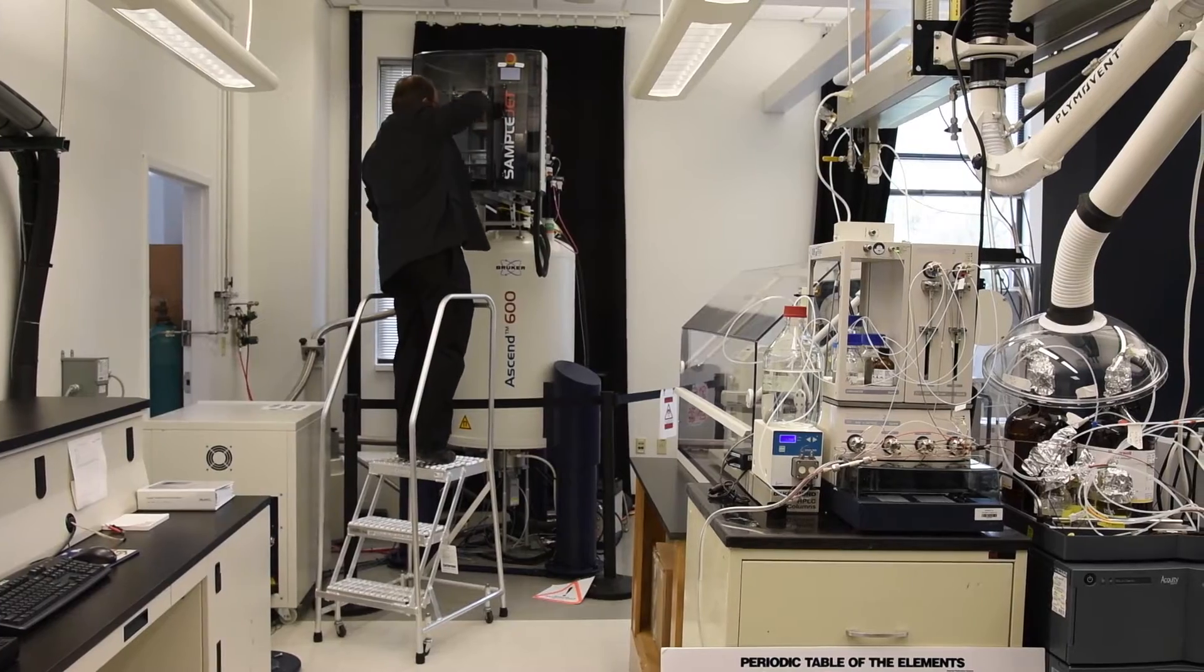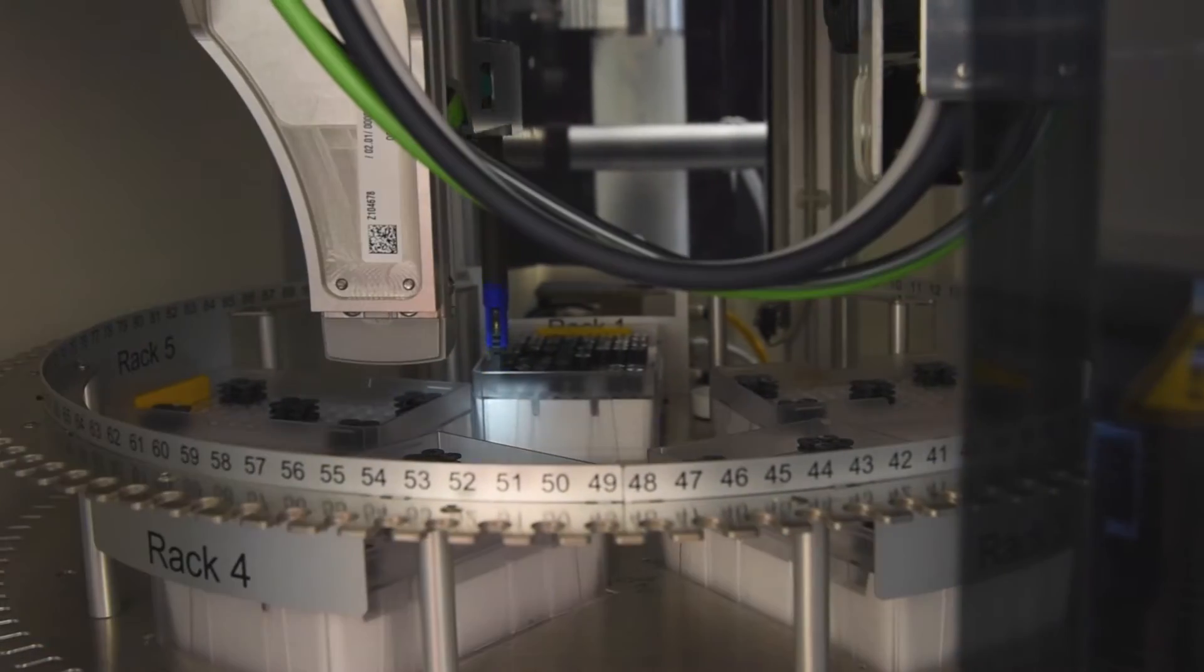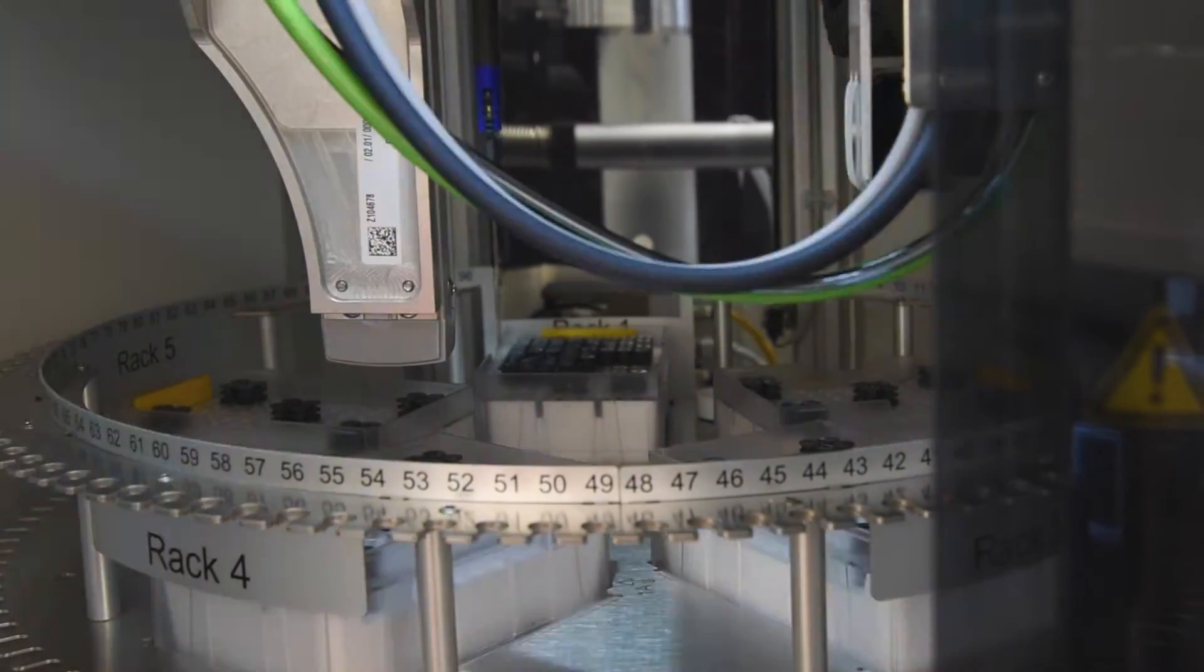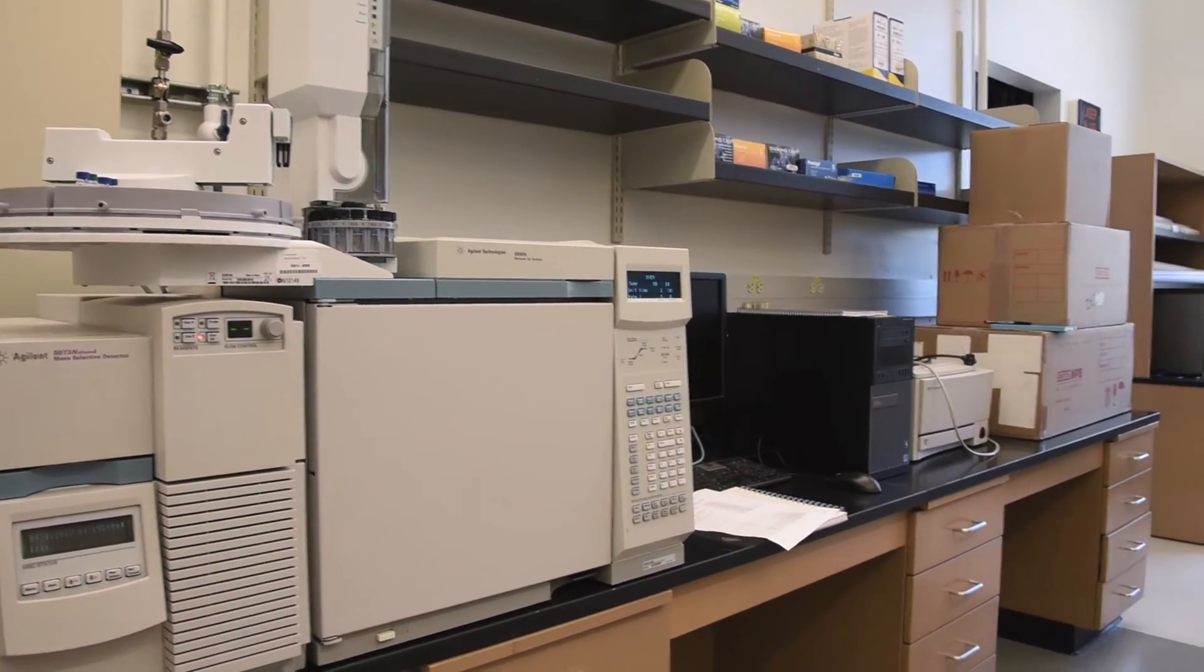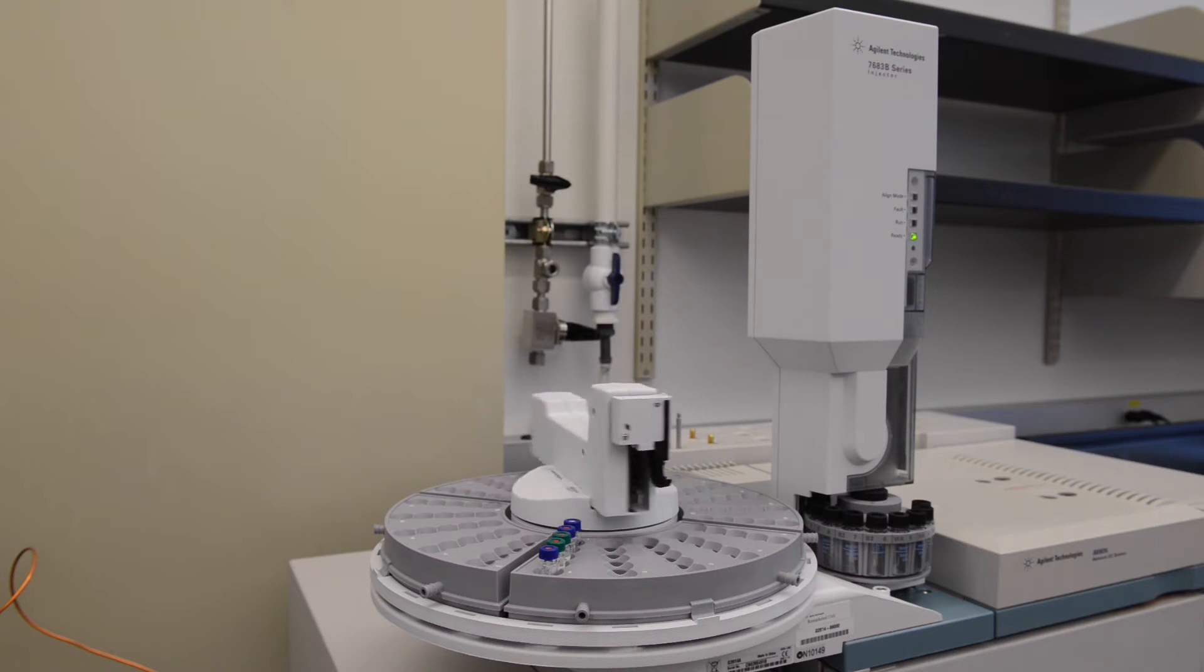We have a 600 megahertz NMR. We have multiple UHPLC QTOF type of instruments that we do LC-MS profiling. We've bought a new GC QTOF, which we'll use for profiling as well. And then we have some targeted tools such as an LC triple quad.